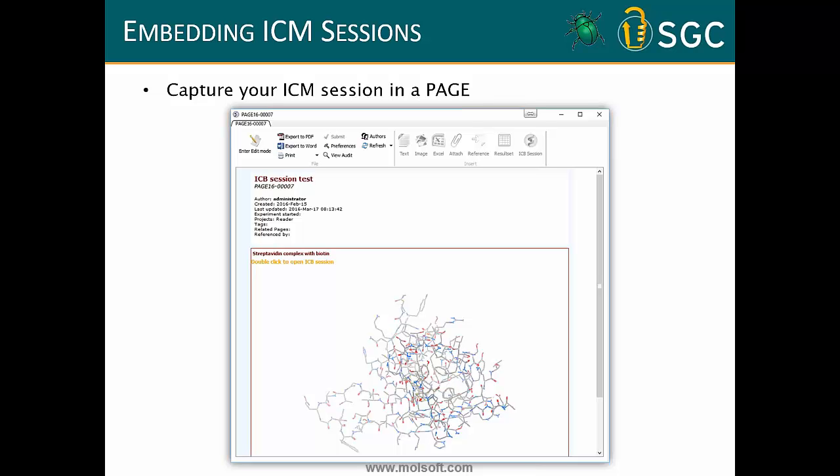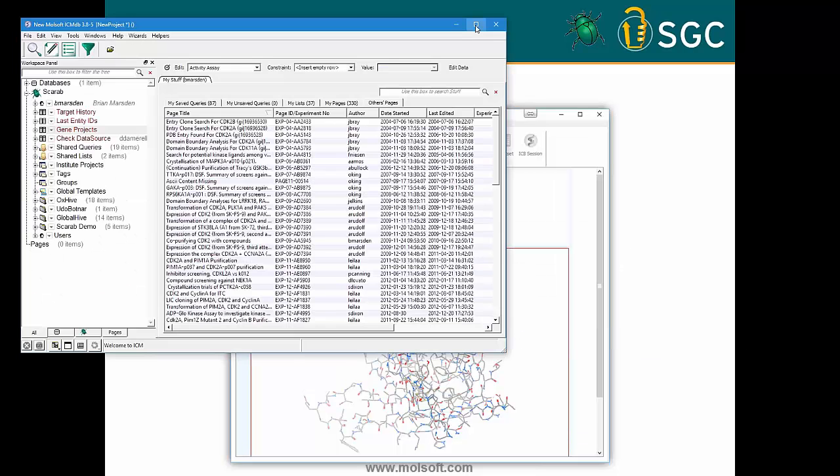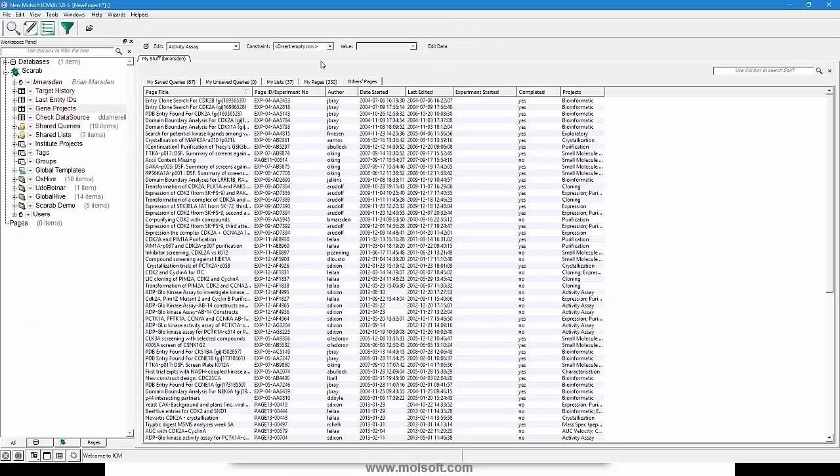Andy, were there any other questions? There was one question about indexing. How do you index? Is there like a Google search? Great question. So let me see if I can pull up my other version of ICM here, of Scarab here.